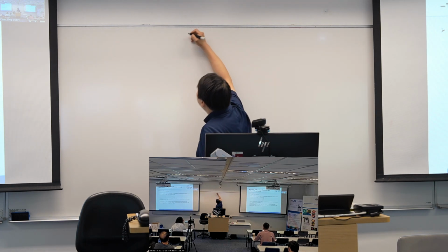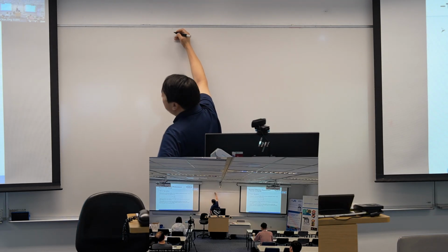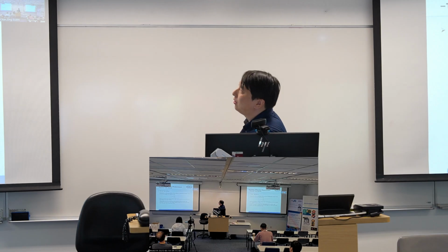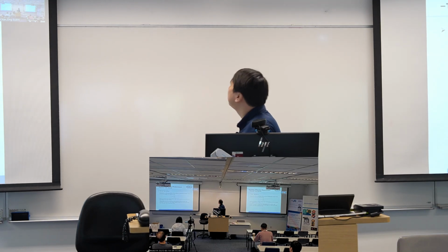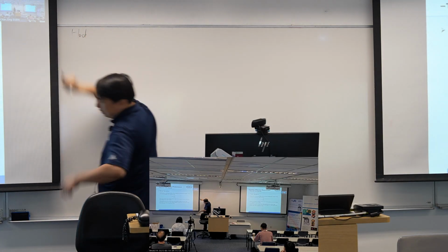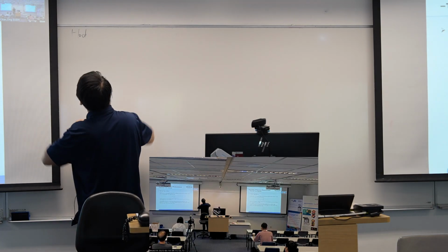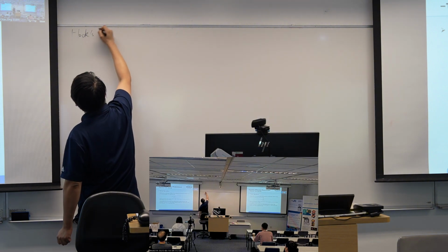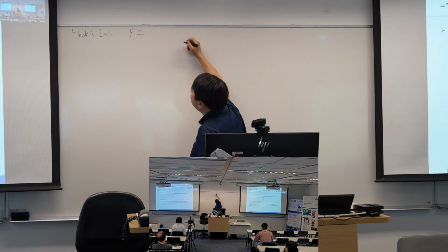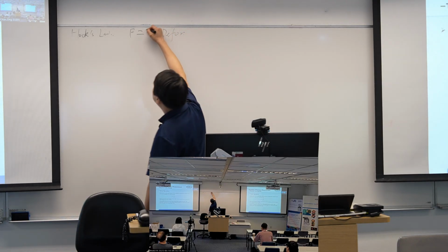So basically, we would like to use AFM to measure the modulus of the sample. And the modulus is used to characterize the material's mechanical properties. So our basic idea is we're starting with Hooke's law, which is the force is proportional to the deformation. And the coefficient, we gave it a name, it's stiffness.